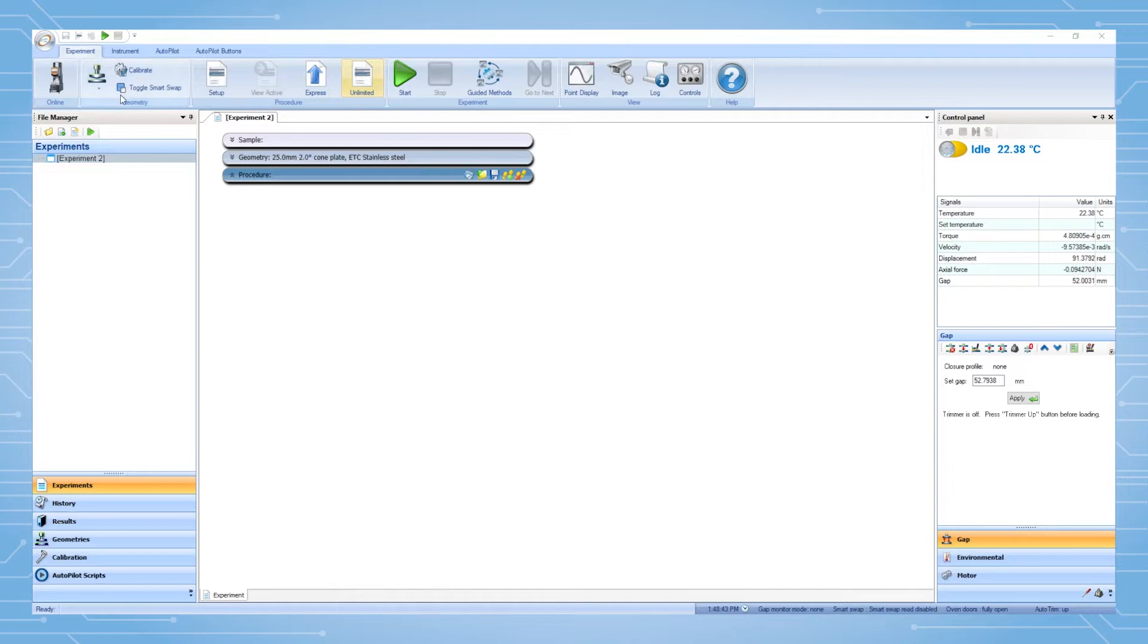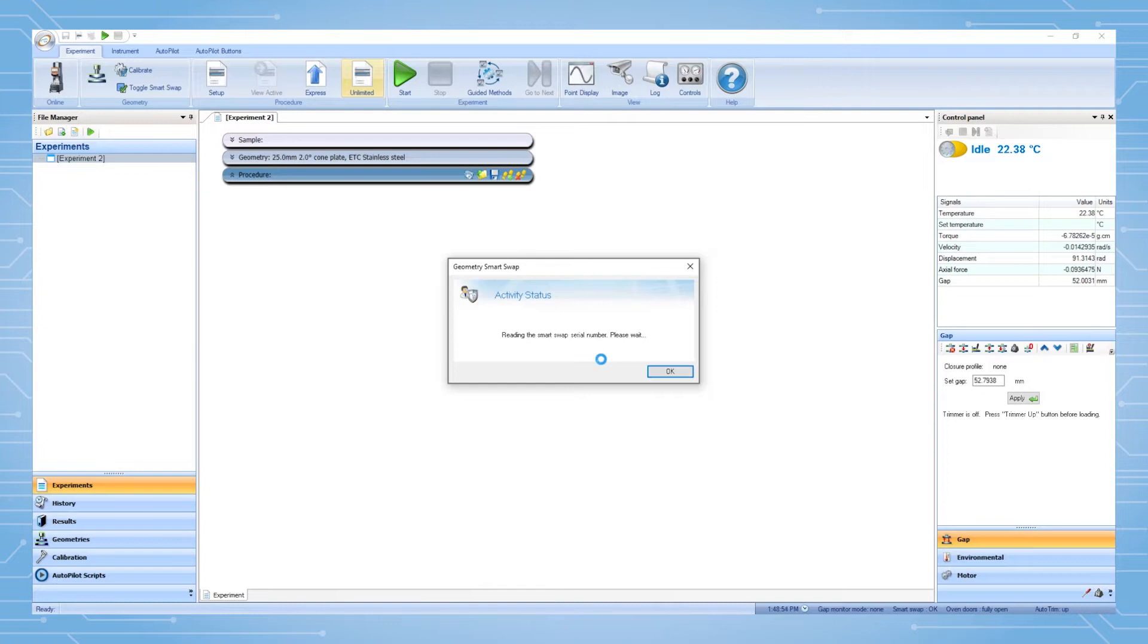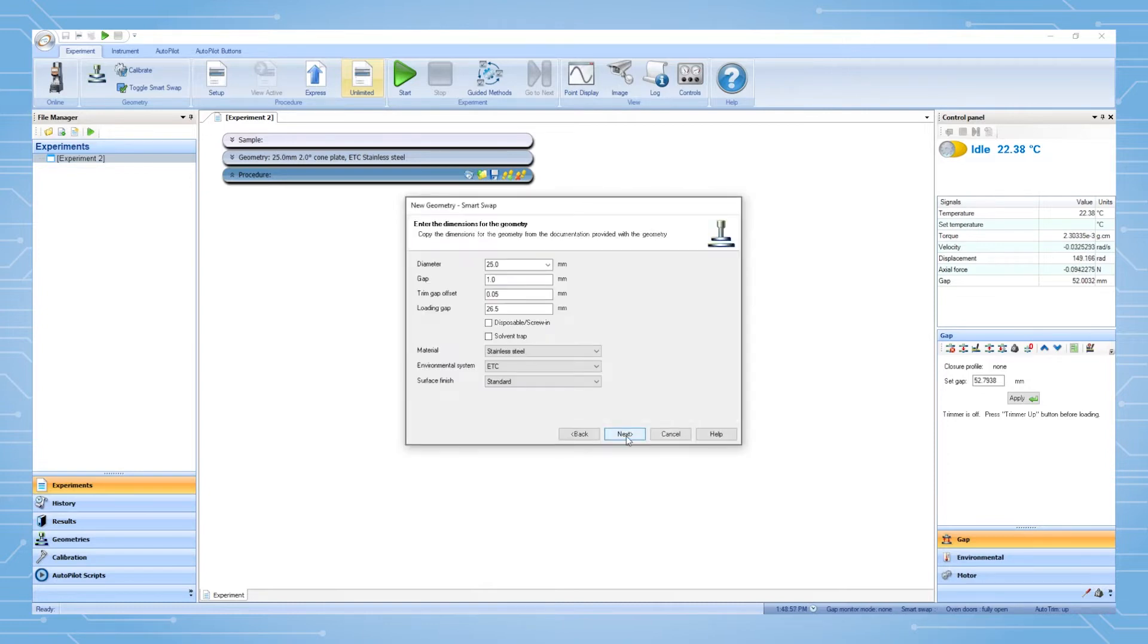With smart swap enabled and showing a green check mark, the geometry label is red and the new geometry wizard starts automatically. Review the parameters and click next, and finally click finish.